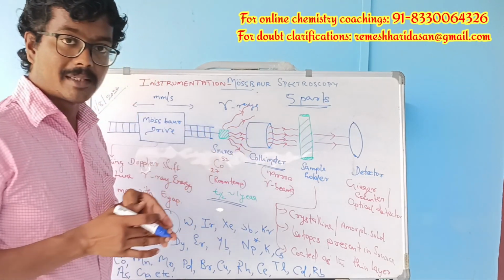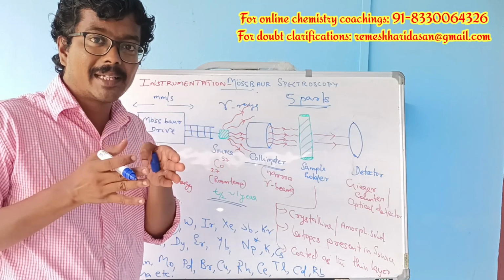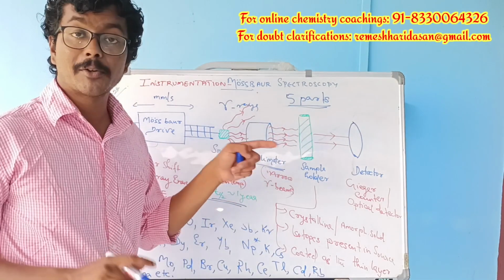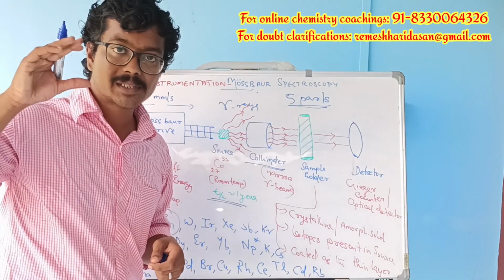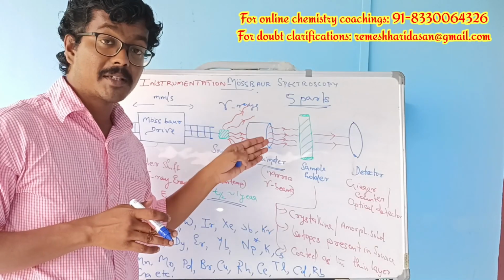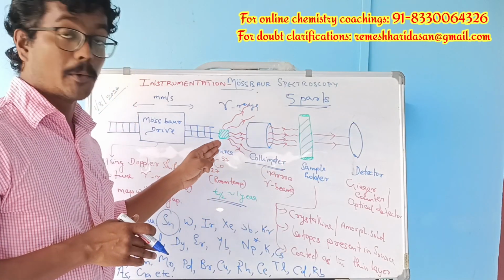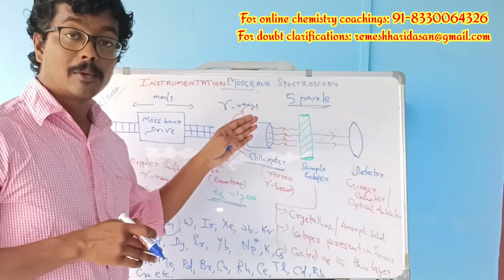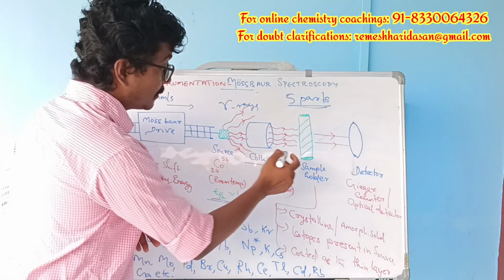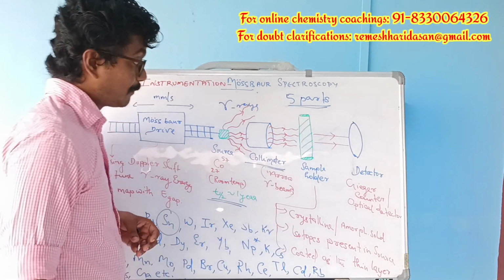So the collimator will filter the spread gamma rays and provide narrow gamma beams, which will be concentrated. So the function of the collimator is to filter the gamma rays emitted by the source and convert them into narrow beams.